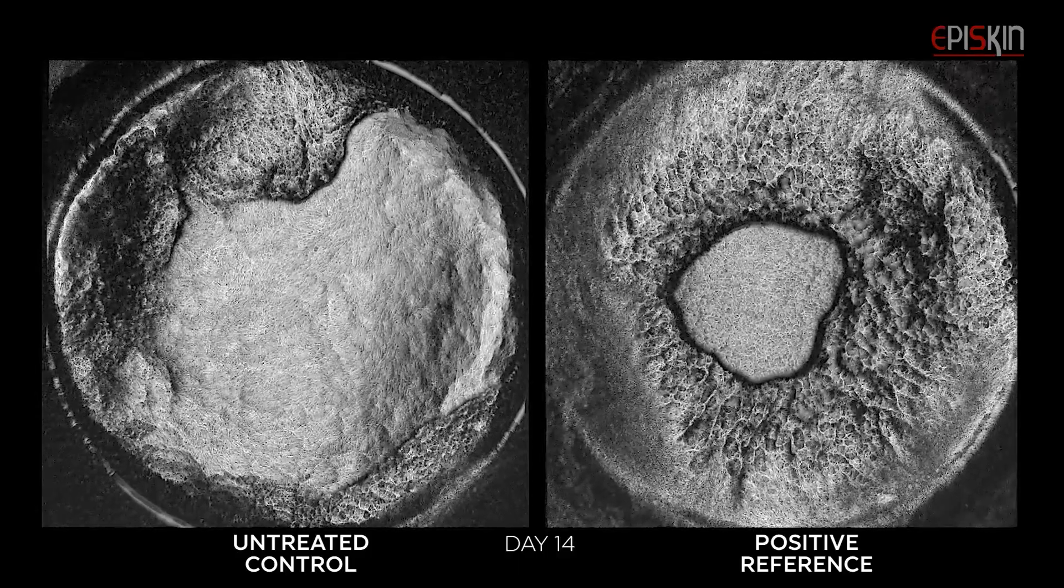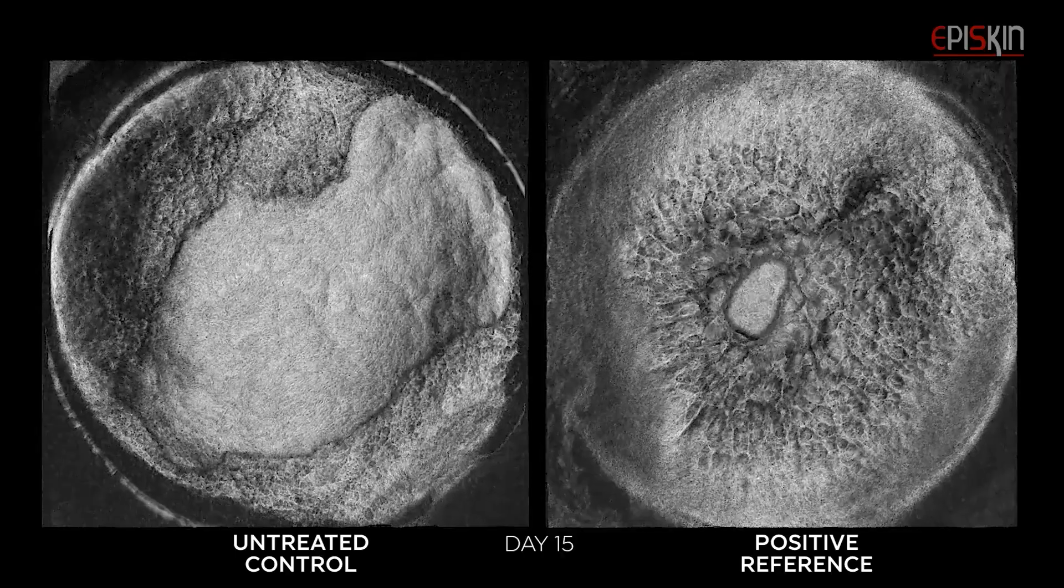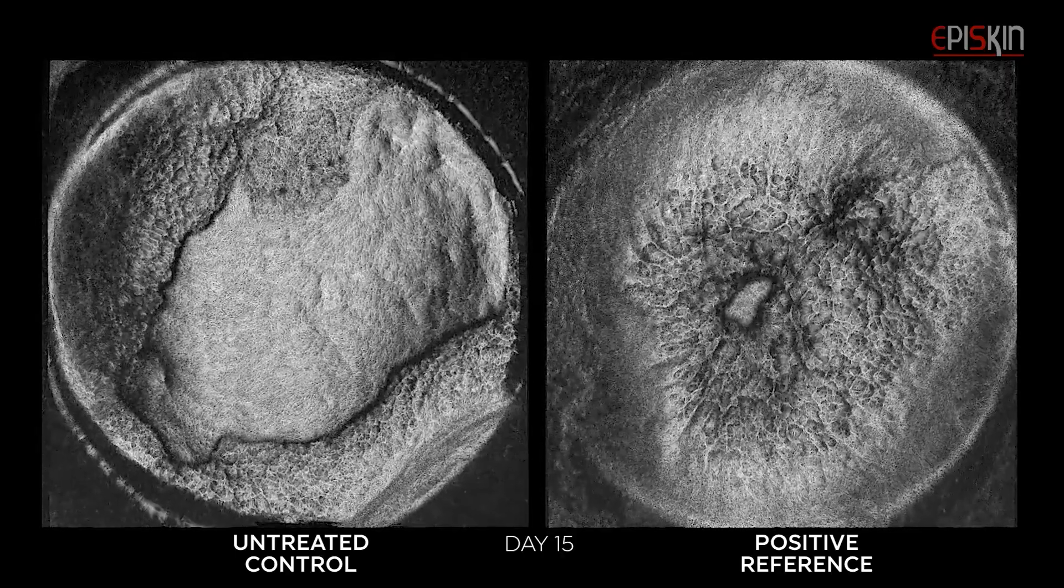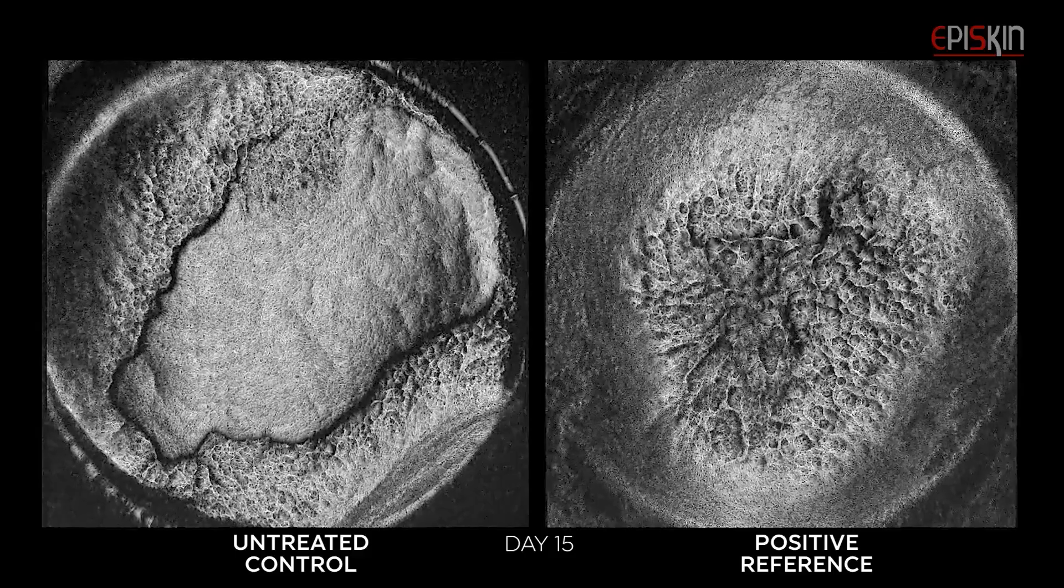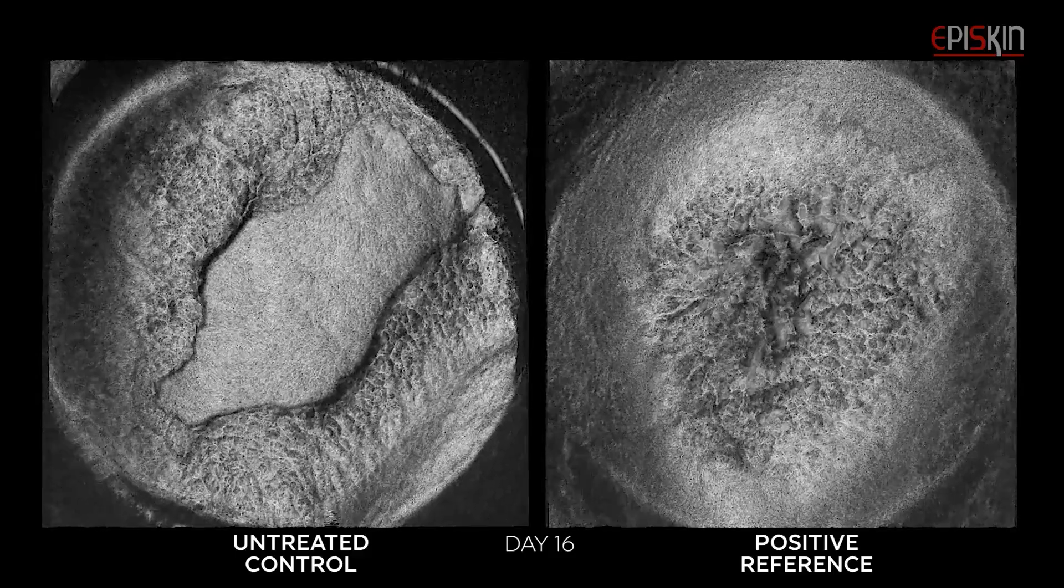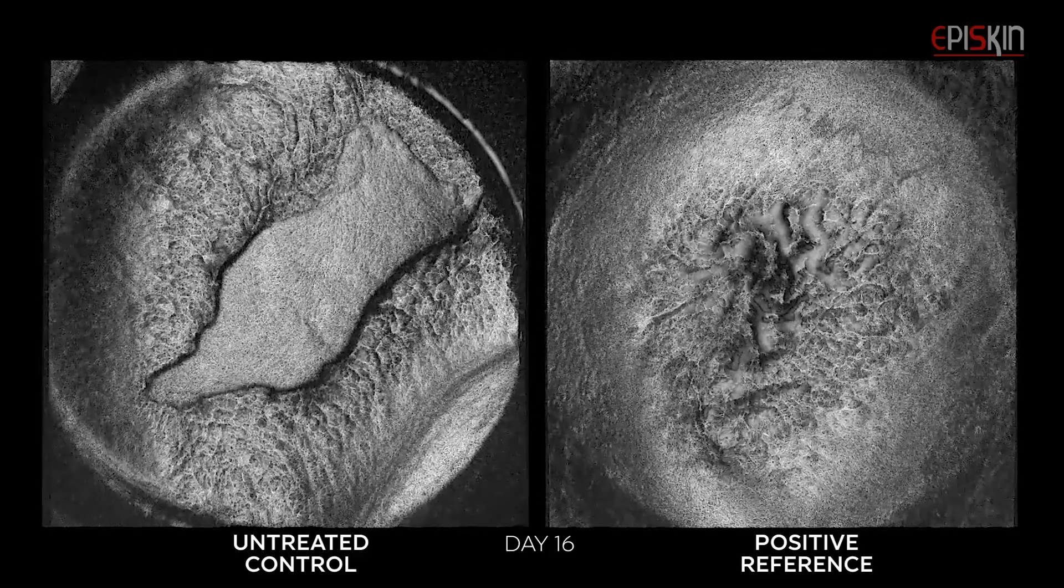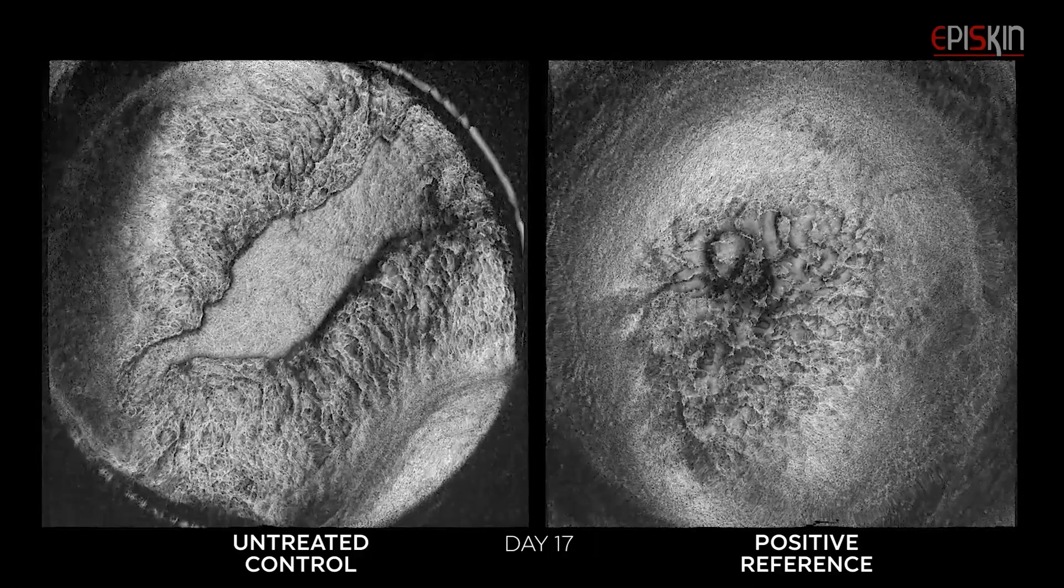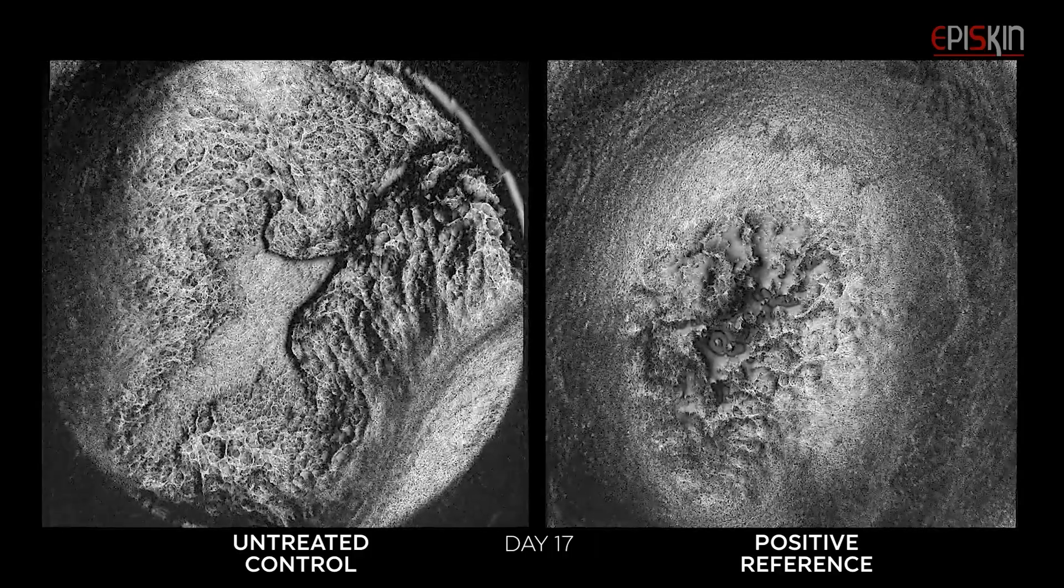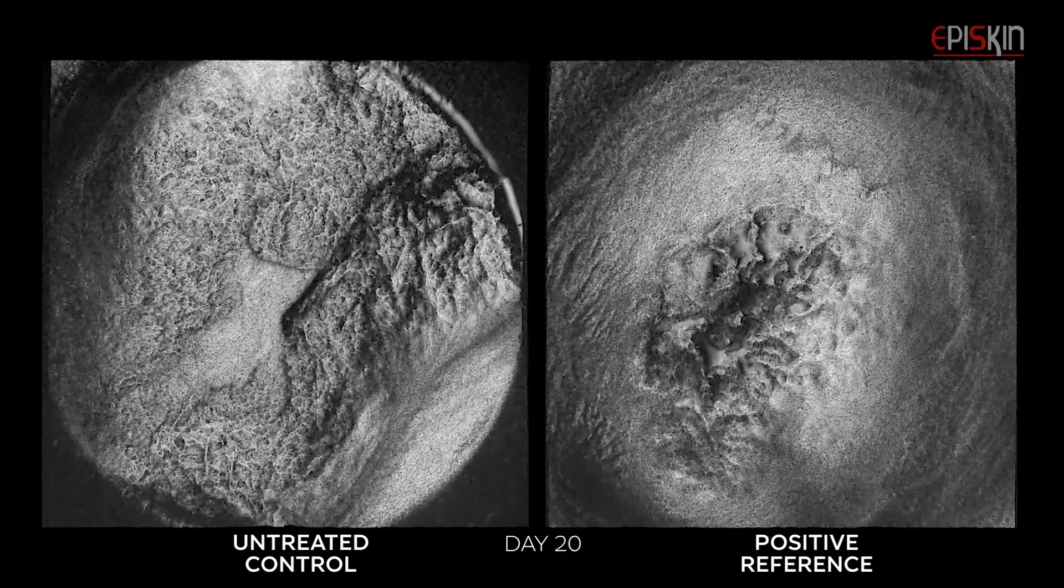It is possible to observe here in parallel an untreated tissue compared to our positive reference. We clearly observe that the pore closure kinetic of the tissue treated with our positive reference occurs on day 15, while the closure of the untreated tissue happens on day 17.